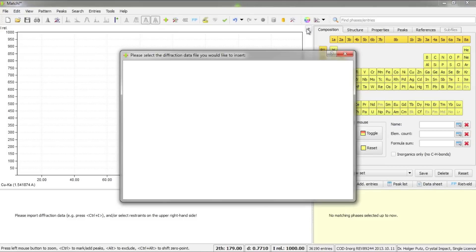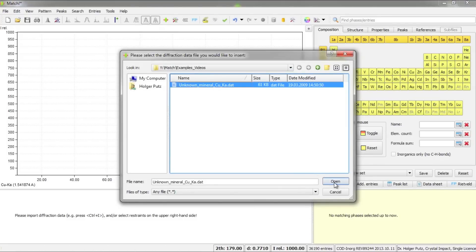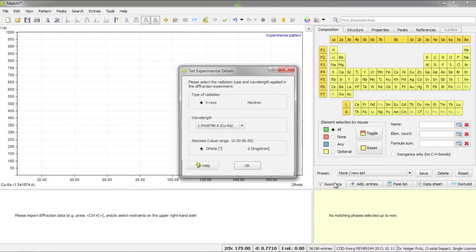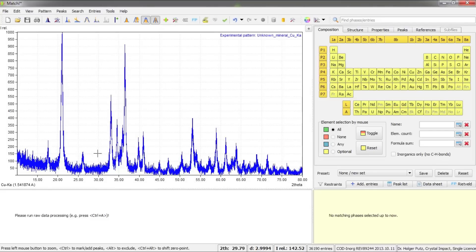I will now import the diffraction data and confirm the wavelength as before. This is now the result — these are the raw diffraction data. You can see all the noise that has caused MATCH to create many peaks that are not so reasonable.